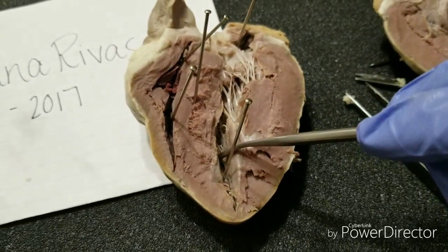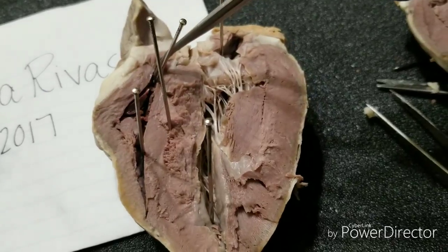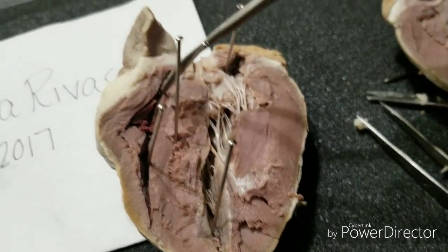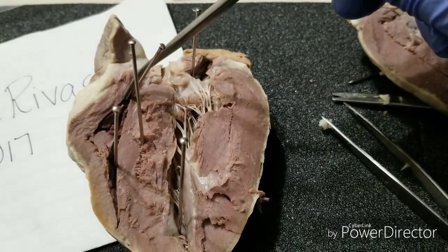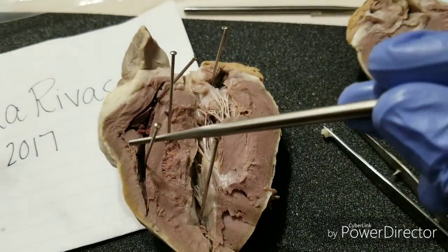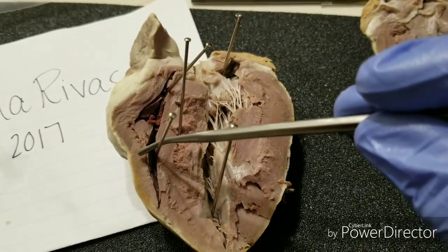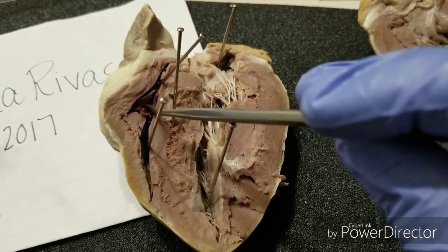We're going to move over to the right side. So the right side, we do have the right atrium, which is right over here, which is this pin that I labeled. And then this is the right ventricle. The right ventricle and the right atrium is separated by the tricuspid valve, which is right over here.